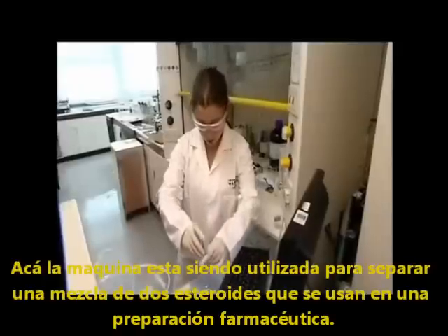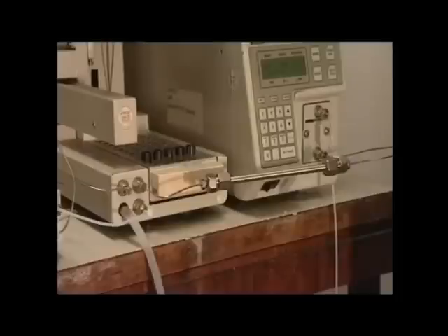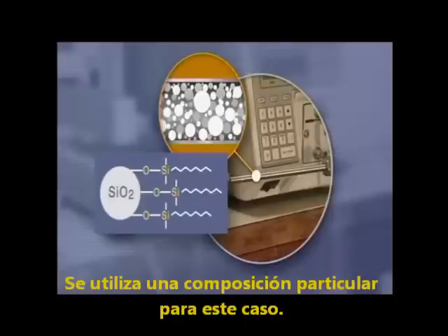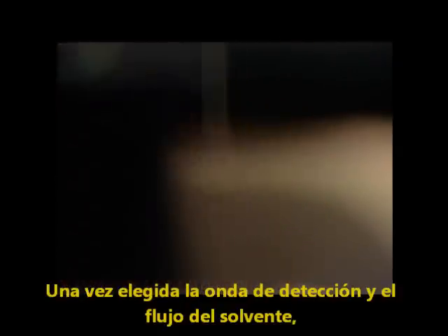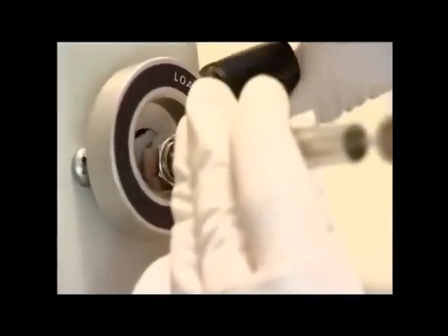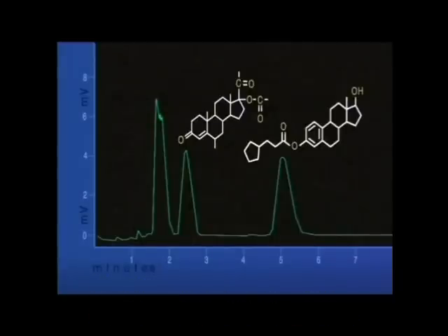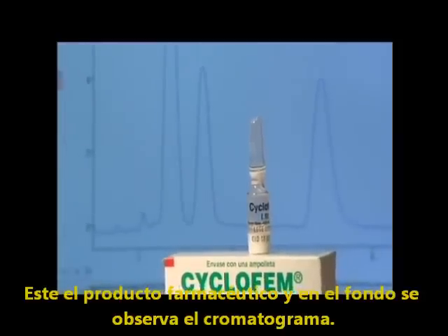Here, the HPLC instrument is being used to separate a mixture of two steroids used in a pharmaceutical preparation. The column chosen is packed with a non-polar solid. The tails of the molecules represent hydrocarbon chains, C8H17. Having chosen the solvents, detector wavelength and flow rate, a single sample is run by injecting about 20 microlitres into the injection port. The more polar component comes off the column first, followed by the less polar. The peak at retention time 1.5 minutes represents other ingredients used in formulating the product. This is the pharmaceutical product and behind it, its chromatogram.